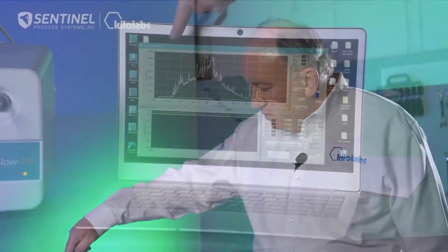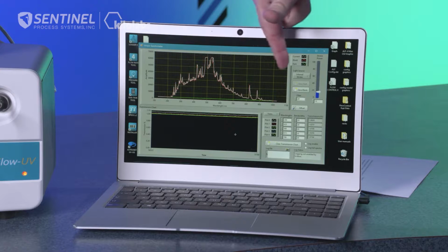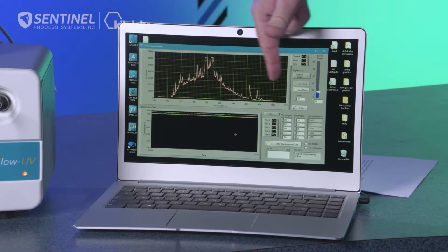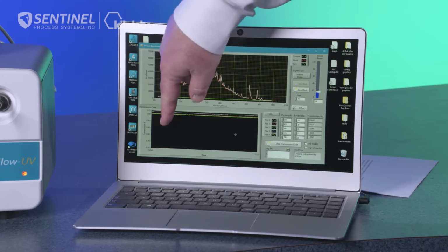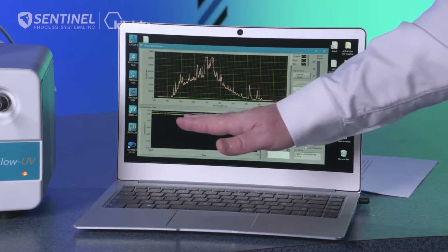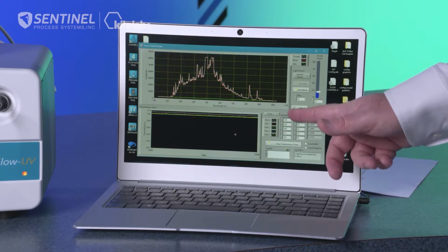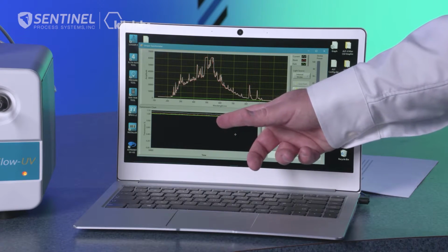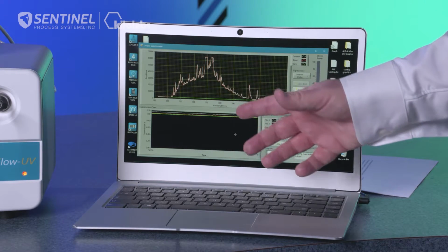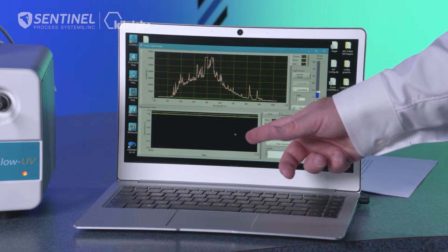The screen for the laptop has several points of interest. One, at the top, is a total UV signature from 200 to 1100 nanometers of everything that you're looking at. The bottom screen shows the 5 user-selected wavelengths, and these will operate in a few minutes, that are set through these buttons over here. So in essence, you're able to follow whatever wavelength that you like, up to 5 of them, and this is also collected in a file for export later.